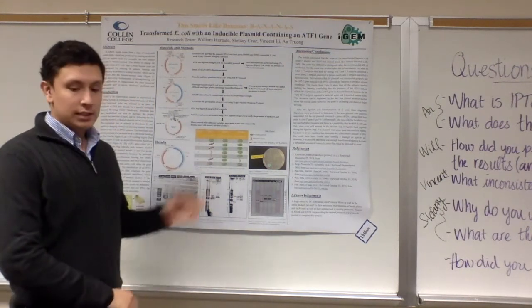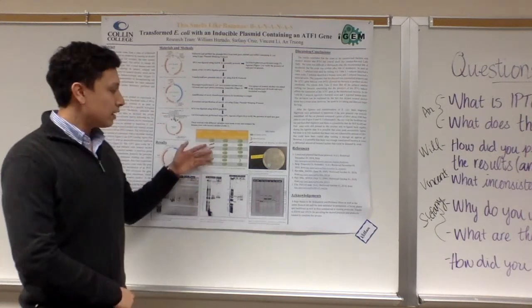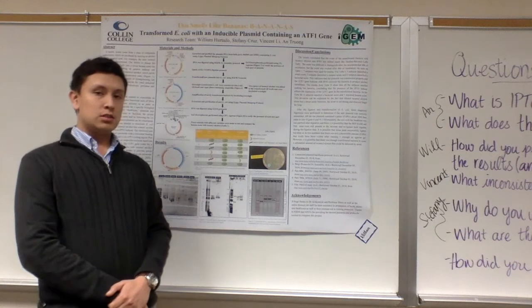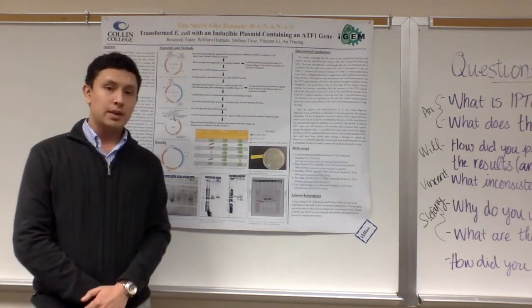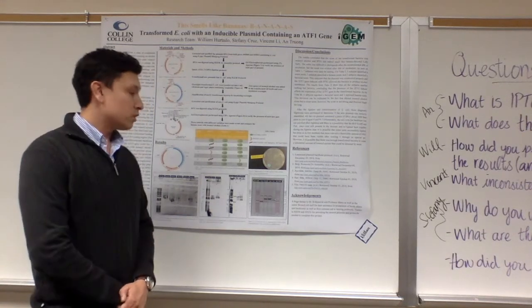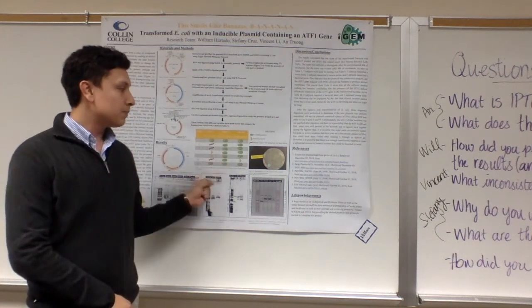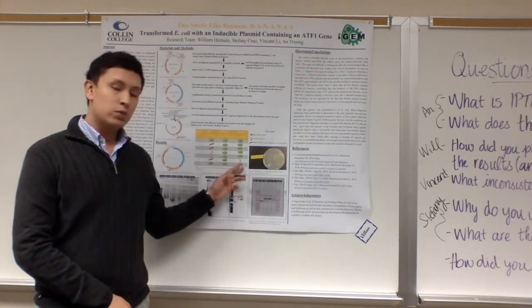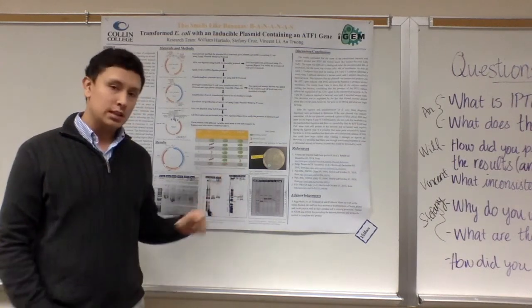After running a sniffing test with 7 subjects from our genetics class, 5 out of the 7 described a sweet or banana smell, and only 2 people described a bacteria smell in tube 1. In tube 2, which was transformed bacteria with no IPTG, everyone agreed that it smelled like bacteria. And in tube 3, with untransformed bacteria and IPTG plus alcohol, only 1 person said they smelled bananas.